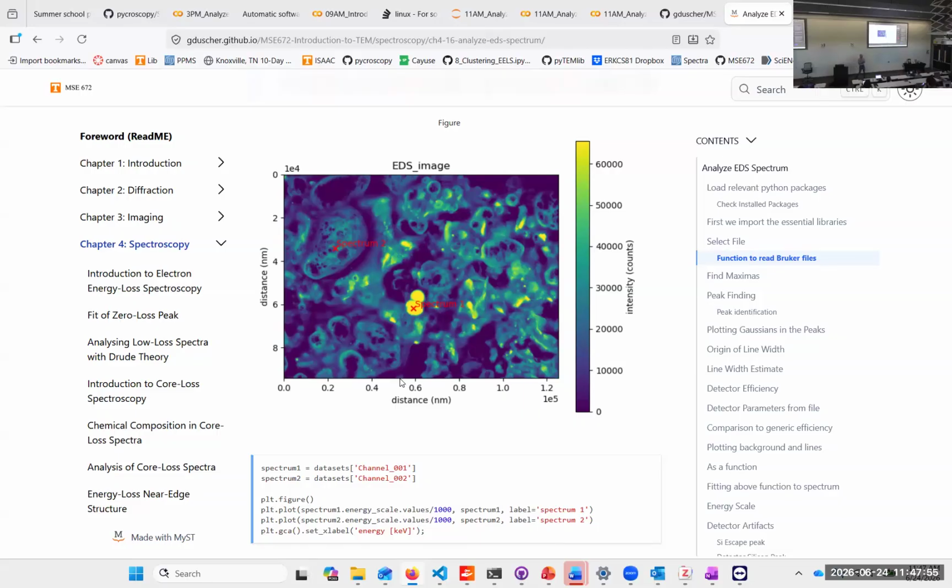It's an SEM image. It's one of these mystery things, right? You get an image, there is a very bright dot there and some other ones. I can guarantee you that you do not guess what it is, even though all of you have seen it and eaten it, I'm 100% sure.